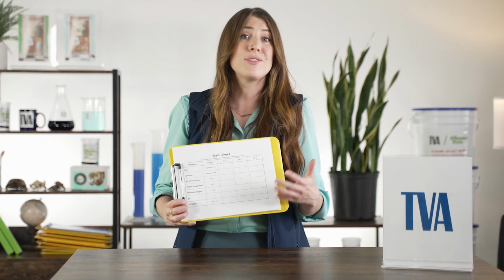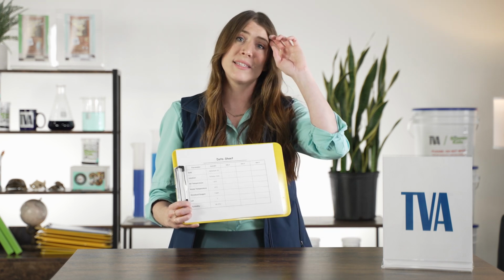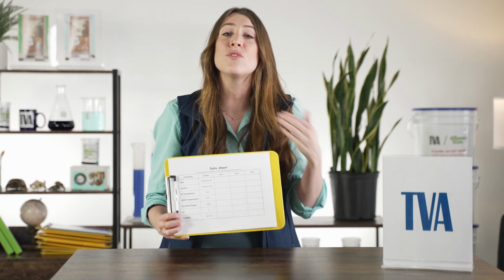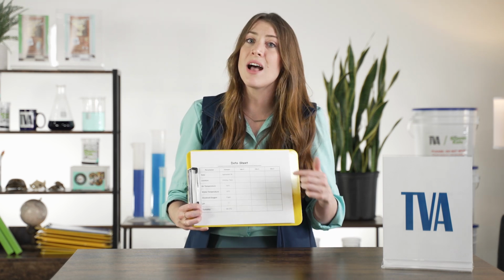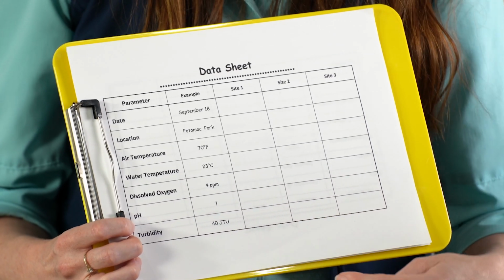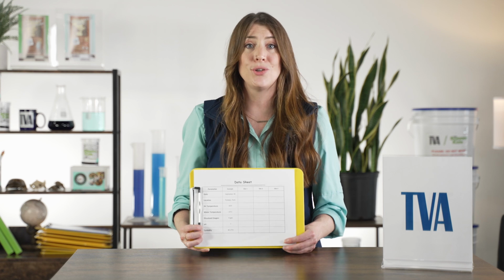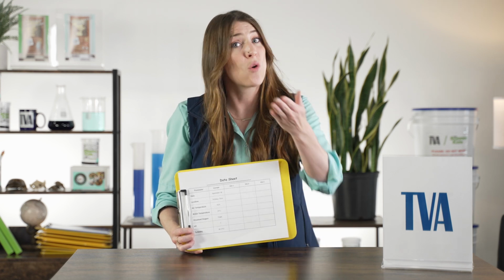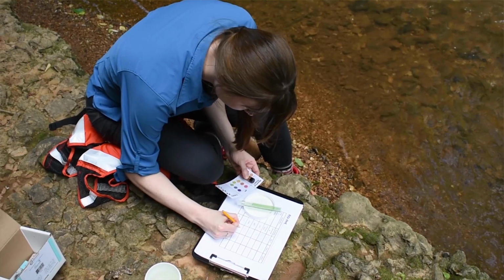That's because we use degrees Fahrenheit most often in the United States. But all over the world, scientists use degrees Celsius, so that's what we will use for our water temperature test today. Dissolved oxygen is also measured in parts per million, and turbidity is measured in JTU. That stands for Jackson Turbidity Units. It's important to include units of measurement, so another scientist or you can replicate your experiment and achieve accurate comparisons.